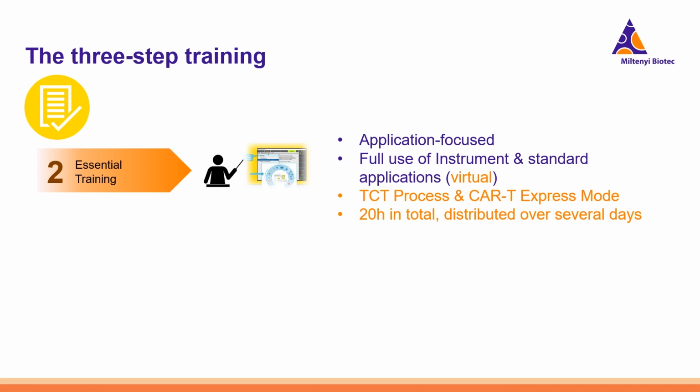And this is a virtual training intended to transmit a broad and full knowledge of both the instruments and the standard applications. The training has 20 hours in total.